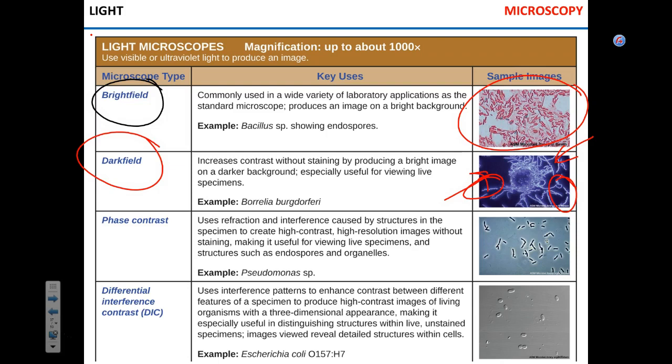So far, we're good. Now, phase contrast. So this is where magic happens. When I say magic, I don't mean actual magic, but the famous British sci-fi writer Arthur Clarke once said that very advanced technology is indistinguishable from magic. So for me, it's indistinguishable from magic.